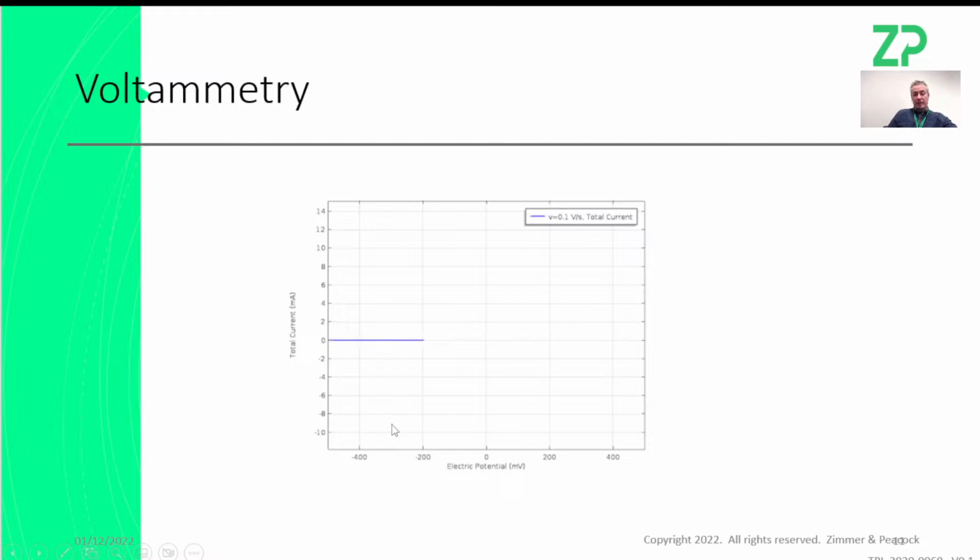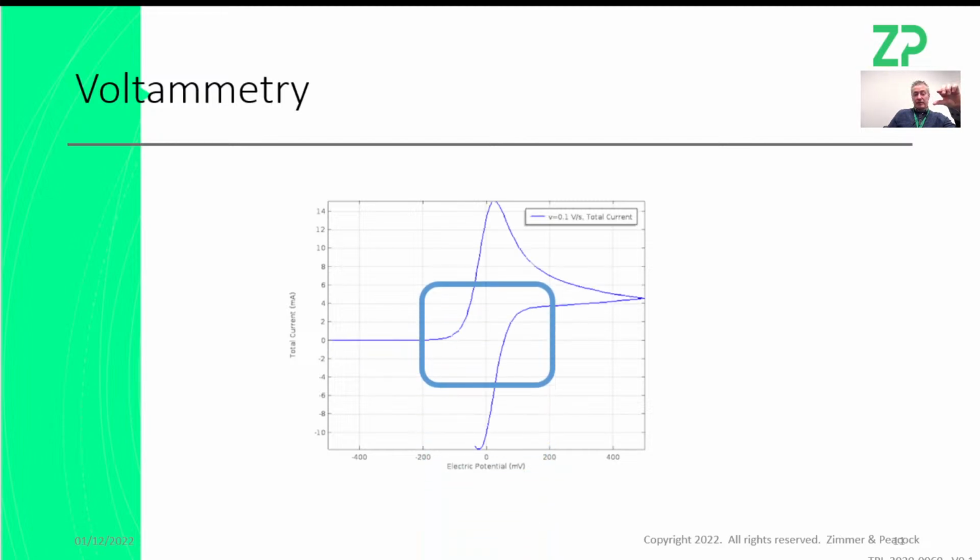Now the question is, can we do voltammetric measurements on these? This is just an animation of a very standard ferrocyanide voltammetry. I've just sketched in that actually if you did the voltammetry on an ion selective electrode, you wouldn't have these oxidations and reductions. You'd have a signal that was much more indicative of a capacitor. We've never really discussed capacitors in any of these webinars, but in answer to your question, I think the capacitance of these electrodes would change with the binding of the ion, be it sodium or potassium, into our sensor of interest, and you see a capacitance change. So the answer to your question is yes.